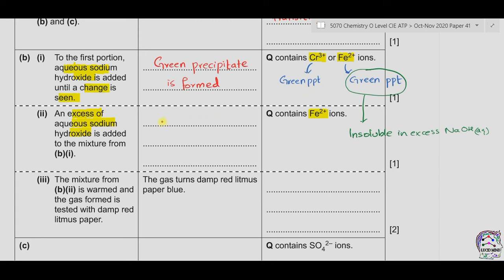So we can write the observation that the precipitate is insoluble in excess.